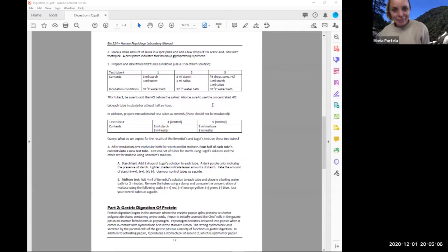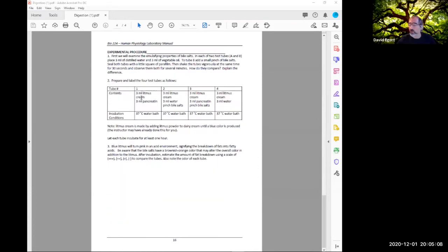So we ran out of time to do the last one, the cream one. Did you come up with anything? No, because we were too busy with the egg whites. We were in a thick discussion about it, so we didn't get a chance. No, I did it. I'll say it for our group. You did? Okay. Not perfect, exactly. But what would you think?